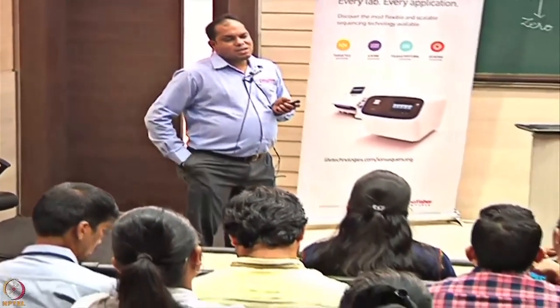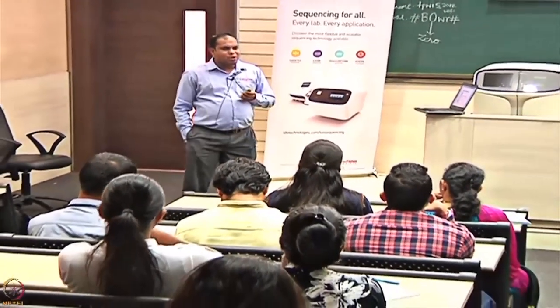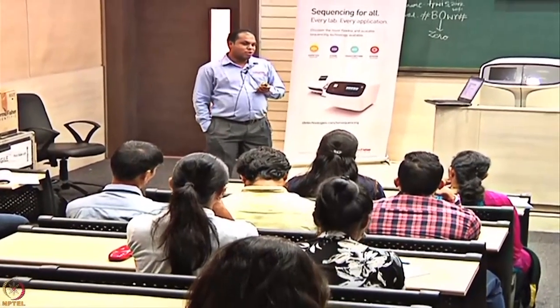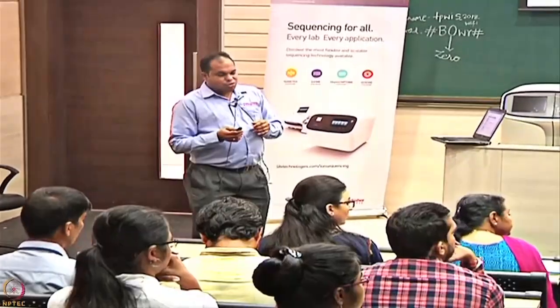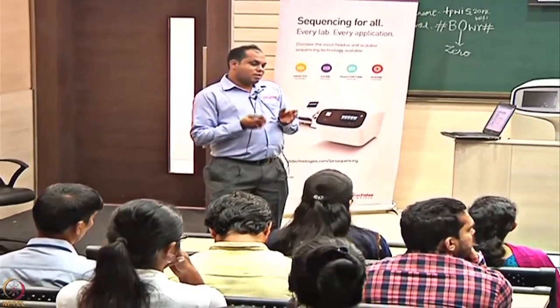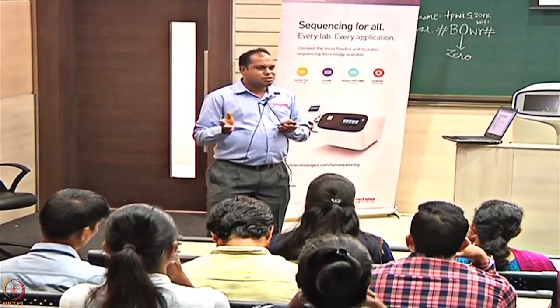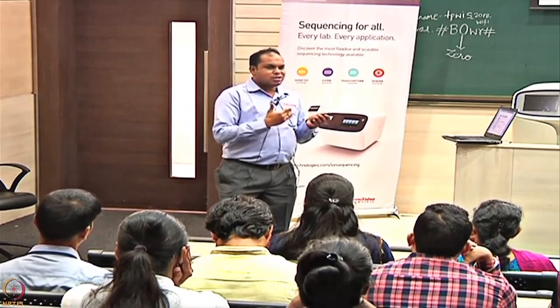So in general, somebody who's using the Ion Reporter or the Oncomine Reporter is making their own formats of reporting these particular variants, this particular data. So they are doing this if they are targeting a particular cancer as such. They have studied the cancer properly.